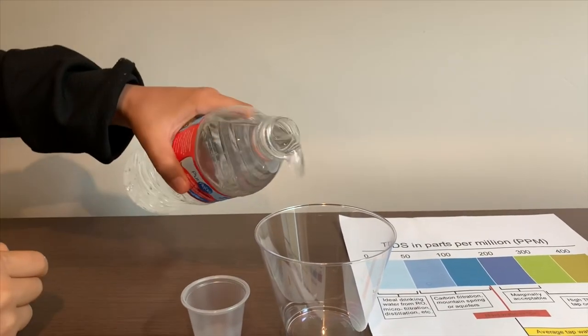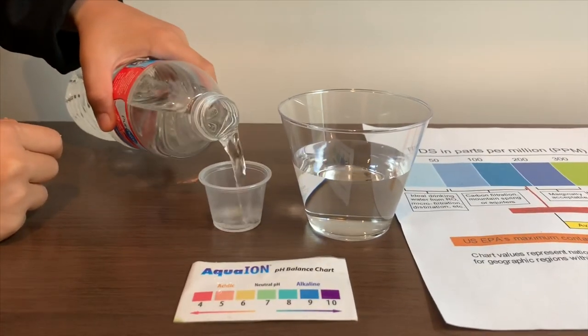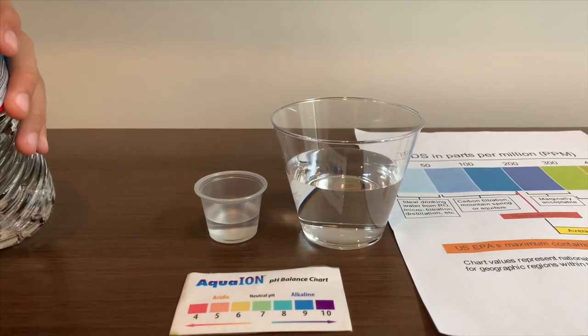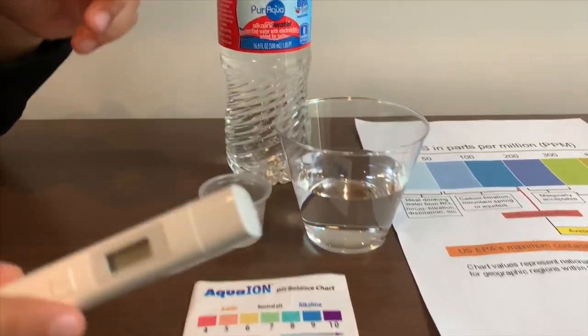Let's pour some water in. First we're going to test the TDS level.